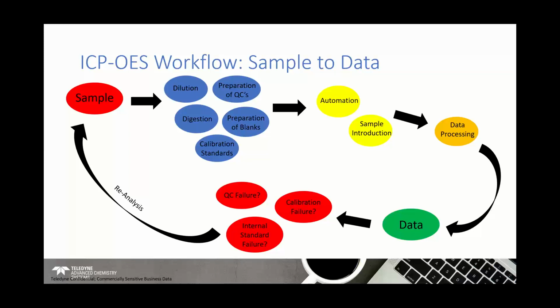So that is our workflow that I want to work through today, but I'm going to focus on two areas. The first area I want to focus on is this one. With the exception of digestion, I want to focus on dilution processes, calibration standards, etc., and what is involved in undertaking that.